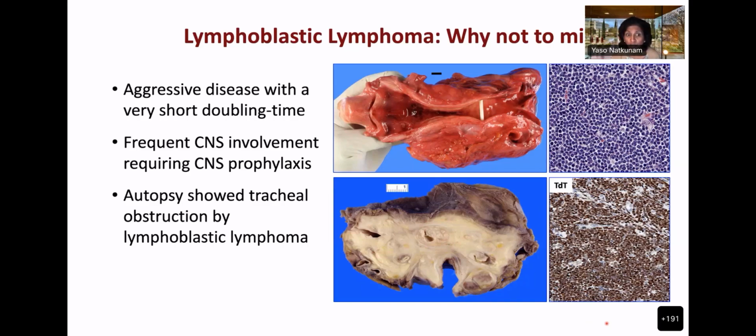I could also call on Sumit if you have additional insights, because the flow helps us a lot, looking for a normal maturing pattern of thymic development versus something that has an arrested pattern. That can be very helpful to pick out along with the morphology. Other tips are cytologic features. Sometimes the blastic lymphoid cells are larger. It's a subtle finding; you may not always have it. Sumit, do you want to add anything about flow?